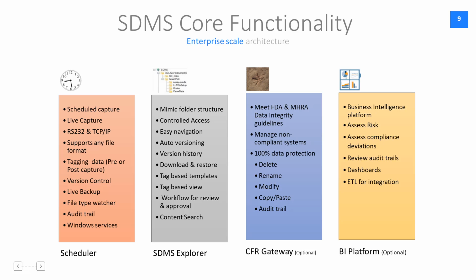LogiLab SDMS also supports tagging of data. That means you can add metadata to the data to be captured. That means there is a pre-tagging capability as well as post-tagging capability. Pre-tagging means you should be able to tag your data before you capture your data.